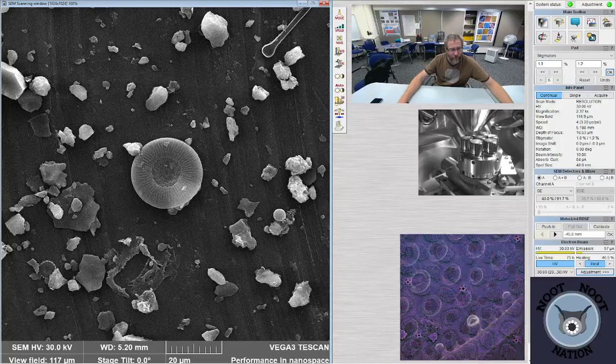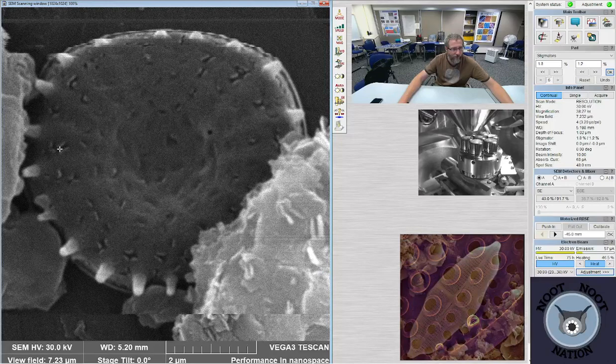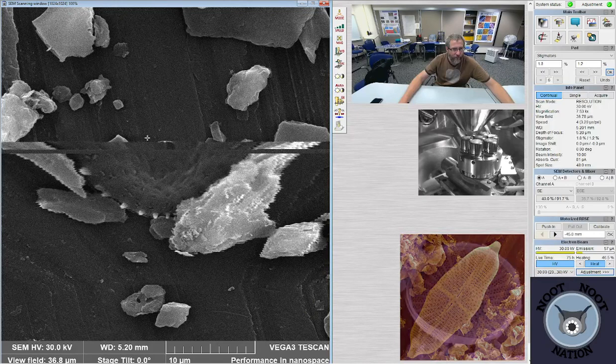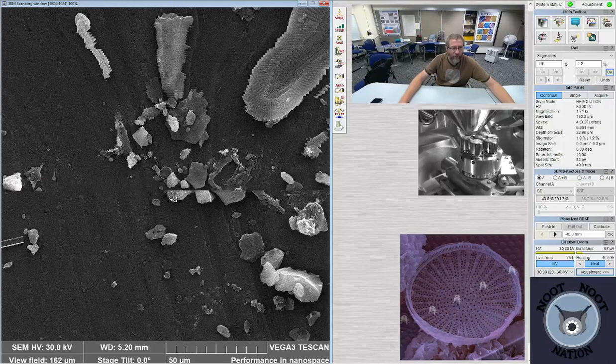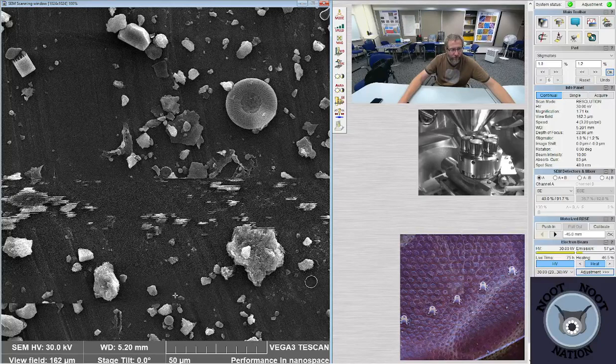There's another, either a microsphere or a chrysophyte cyst. And here's a little tiny Stephanodiscus. Probably belongs to rugosa or something like that. These little tiny slit-shaped openings, and then a spine at the end of every one of the costae. So I'm zooming out, obviously, right now. There's another internal view of Lindavia. This is a girdle view or side view of an Aulacoseira. These are all different types of diatoms.